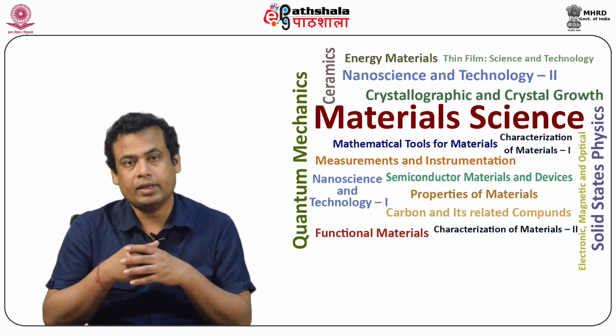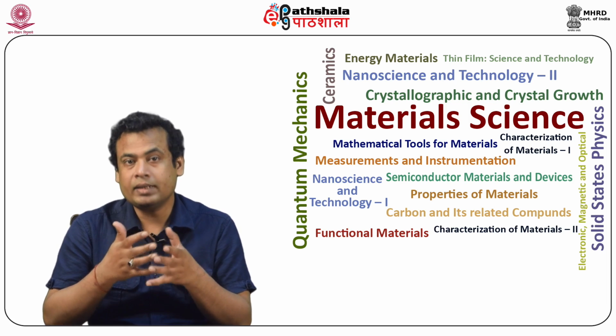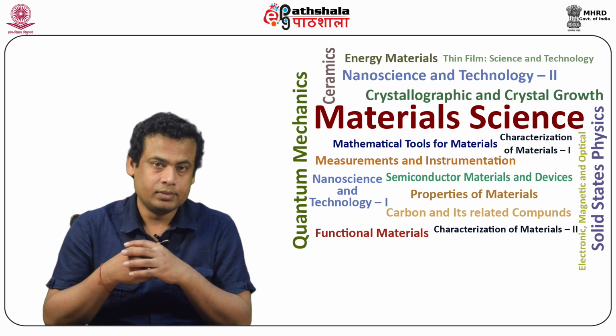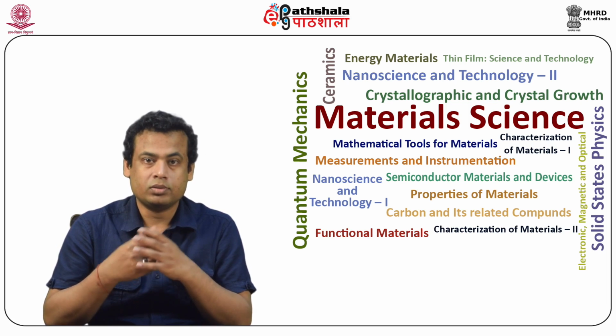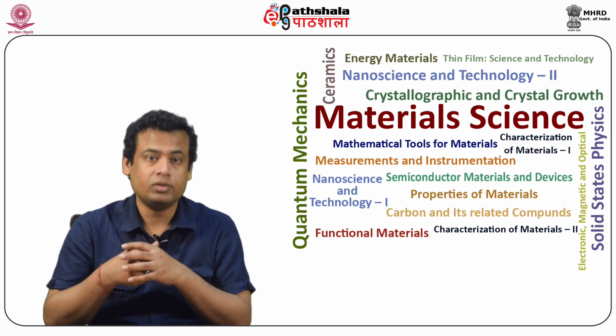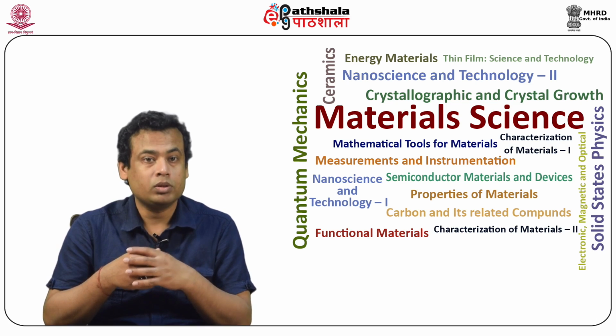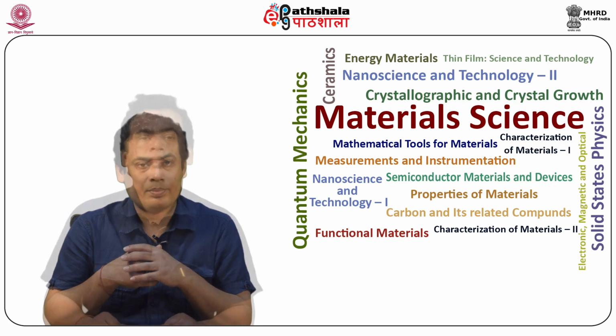The number of secondary electrons can be greater than the number of incoming electrons. They are used to reveal the surface structure of a material with a resolution of about 10 nanometers or better.